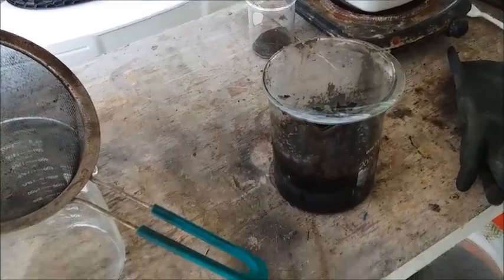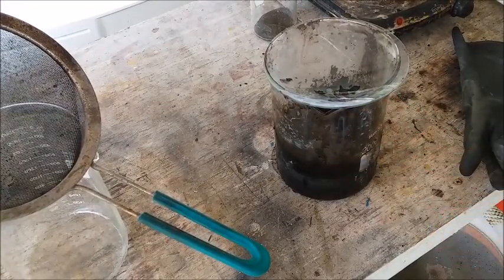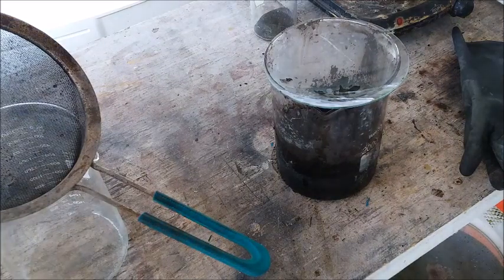All right, it's the next day. This is cooled off. Boy, what a mess. So I better get my gloves on before I mess with that. Yeah, it's a bit of a mess from the boil over, but I left it on the heat for a couple of hours after that. Not much seemed to be happening. Added a little more acid to it again. Not much seemed to be happening. So I'm pretty sure the reaction is done.